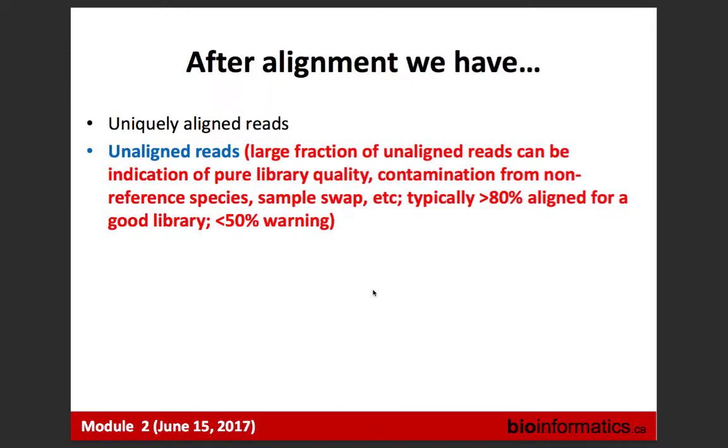Then there are unaligned reads, and the reason for this can be anything, and that's for the individual experiment. In some experiments, we can expect some fraction of unaligned reads.